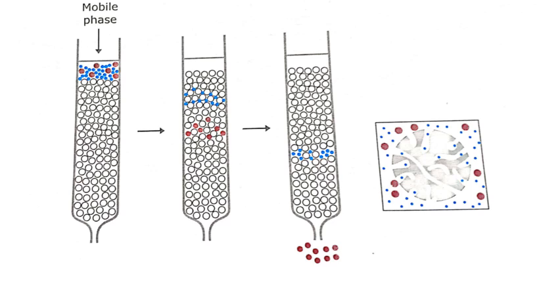In the right side picture there is a bead which can accommodate the blue molecules but cannot accommodate the brown molecules. By this picture you can understand the total basis of the whole process. So I again repeat that the bigger molecules, which cannot enter the beads, will elute faster, but the smaller ones, which can enter the beads, will elute later.